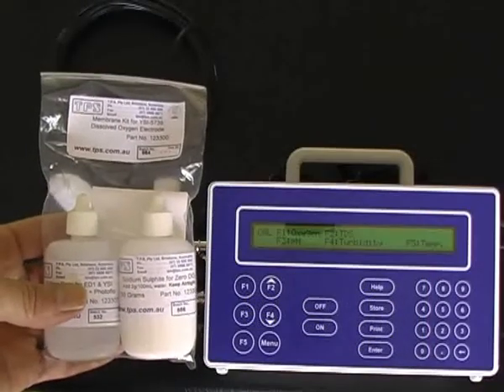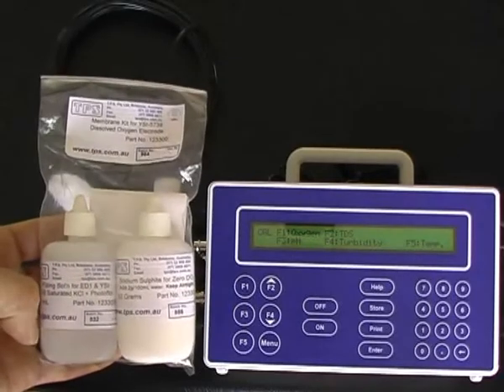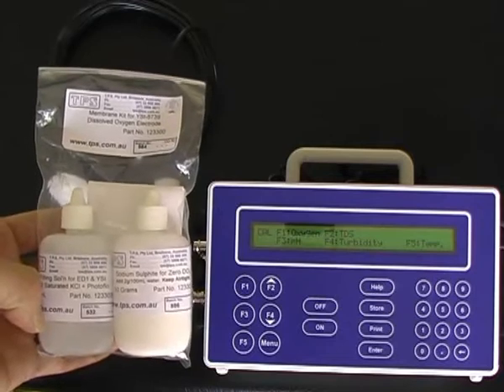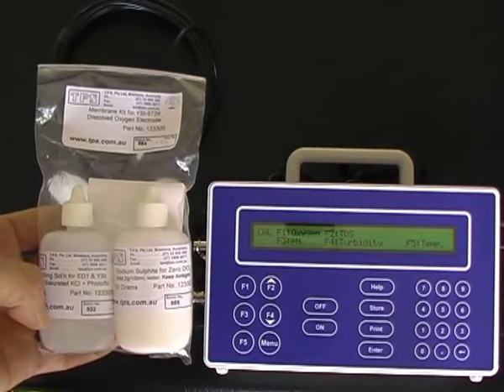The 90FLT is supplied with a dissolved oxygen membrane calibration kit, which includes sodium sulfite powder, a bottle of filling solution, membranes, and O-rings to fit the membranes.